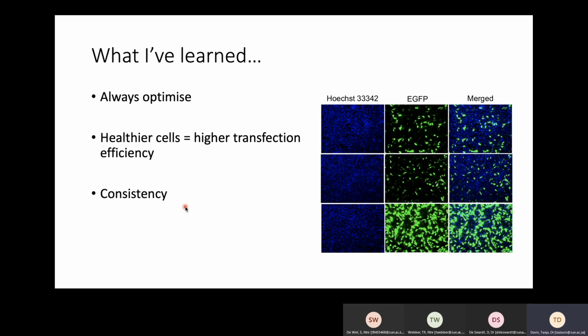Actually, I think that if you have a little bit of OCD, this is always a good thing when it comes to transfections. Making sure you always seed the exact same amount of cells. They are showing the exact same level of confluency. You're mixing everything exactly the same. It goes a very long way in making sure your experiments go the way they should.